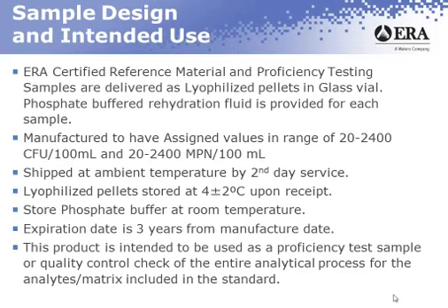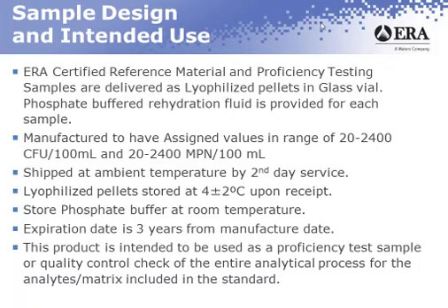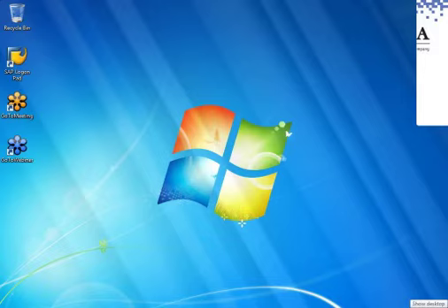Once you've warmed that to room temperature, you should already have your buffer solutions at room temperature. So all you need to do is aseptically transfer the pellet from its glass vial over to the buffer. You can accomplish this in a variety of ways. I've been doing this for years and I'm pretty comfortable with it. I just pour it, and it is quite simple to do.